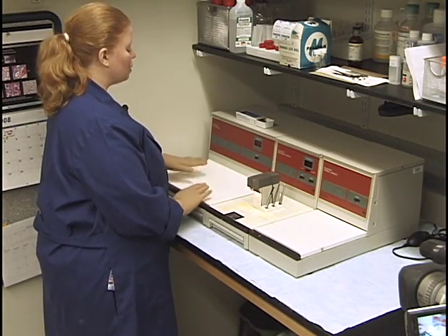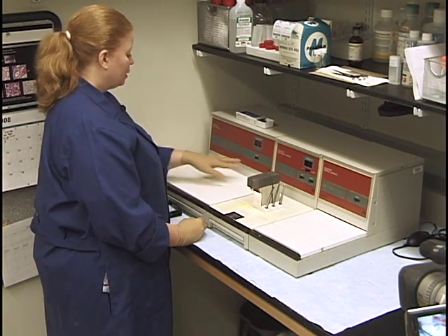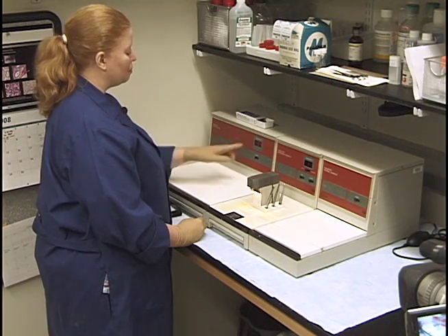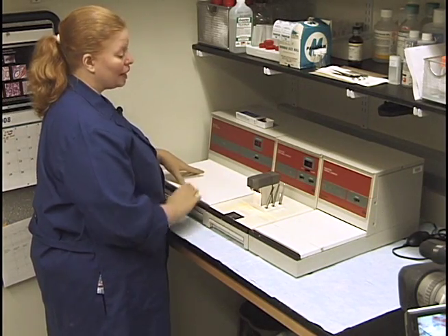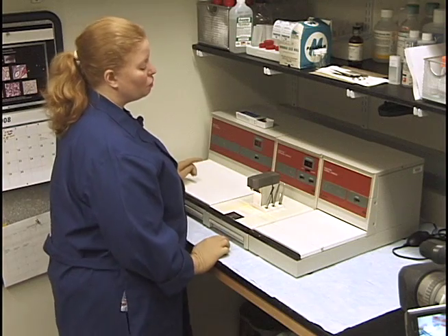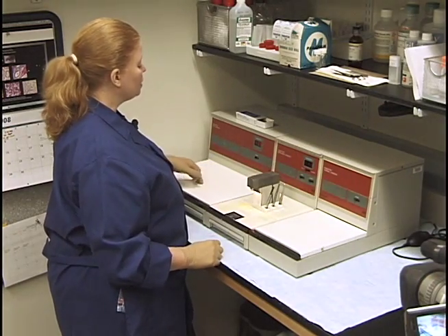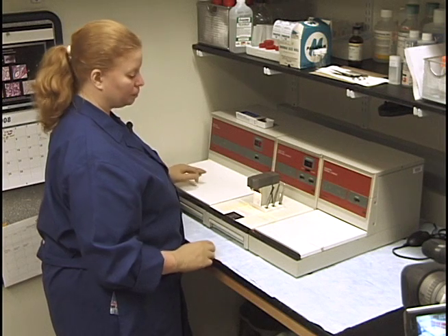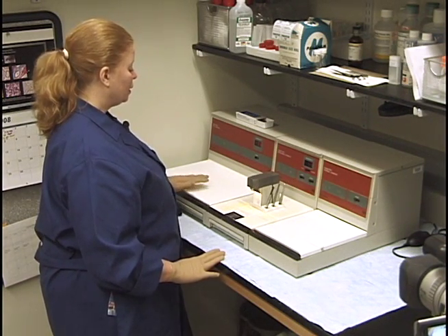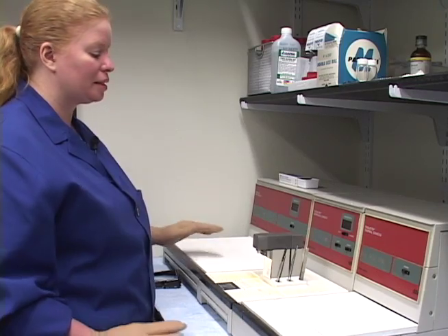This whole area over here is the cryo console. You want it between minus four and minus seven, and it takes about 20 minutes to half an hour to reach the right temperature for embedding. I turn all of this on in advance. You really don't want to leave the cryo console on 24 hours or longer — it's like leaving your freezer open and it will just break it.